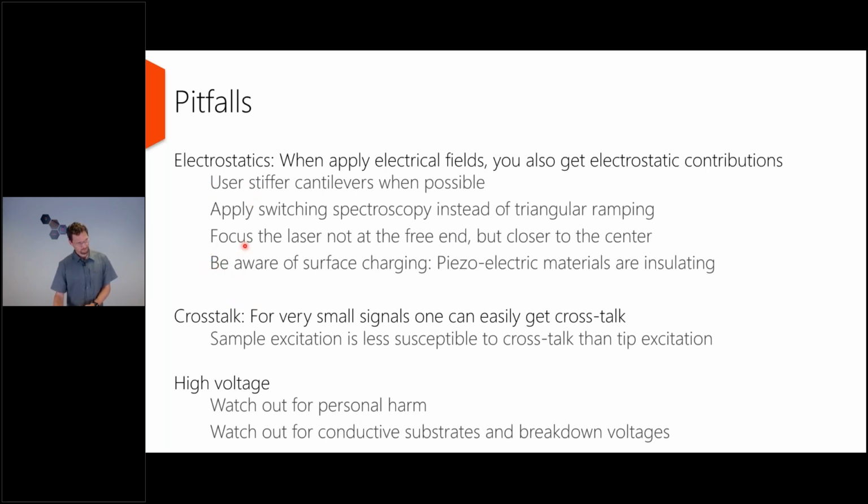Electrostatics works by the field itself, but also be aware of surface charging. Piezoelectric materials are insulating. That means if you put a tip on top and you apply a large voltage, you may introduce a surface charge.